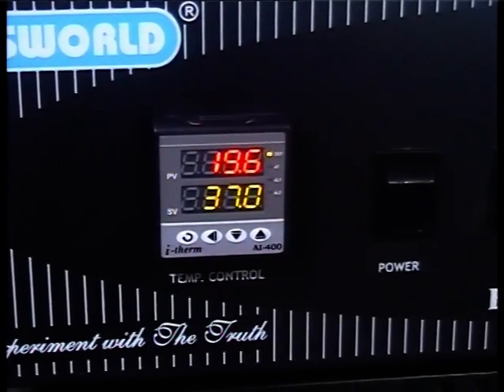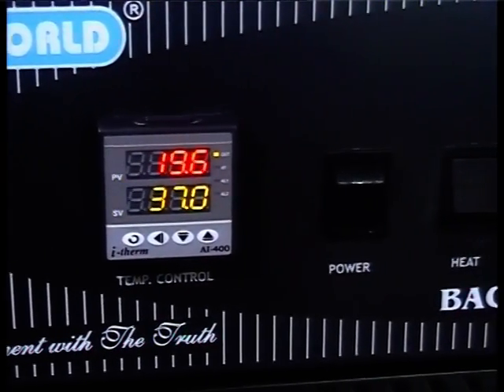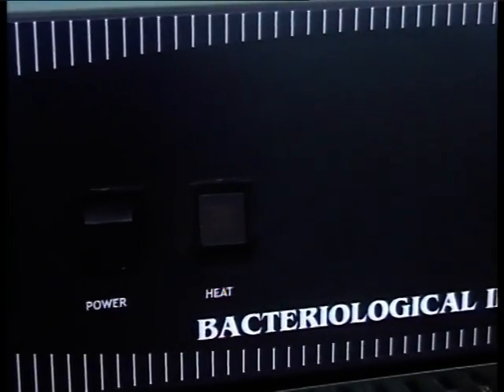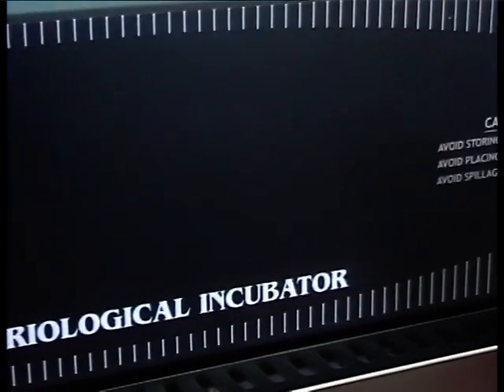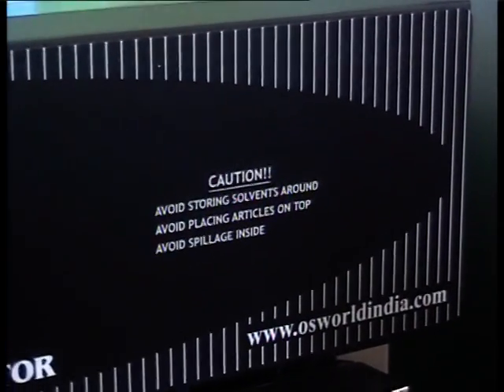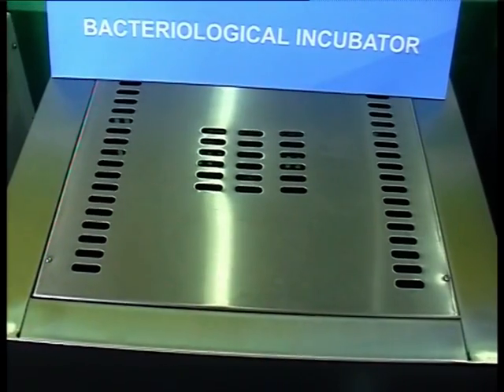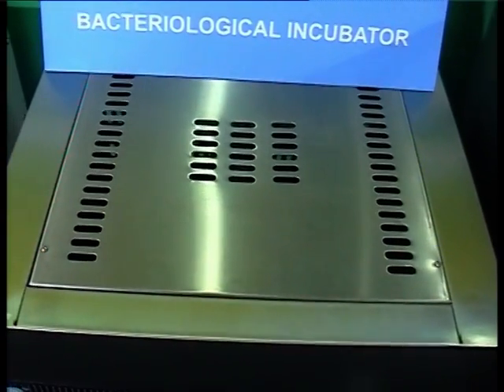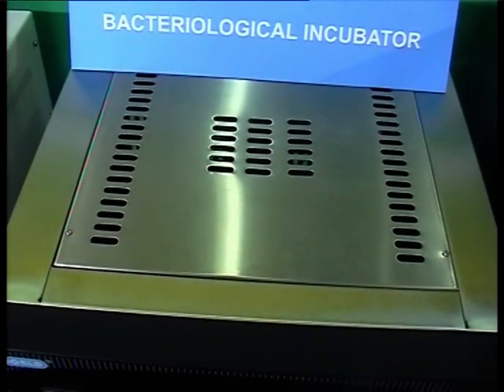It is designed as per ICH guidelines and FDA regulations. The temperature range of this incubator is ambient 5 to 60 degrees Celsius, with a temperature control accuracy of ±0.2 degrees Celsius of set point and temperature uniformity of ±0.5 degrees Celsius.